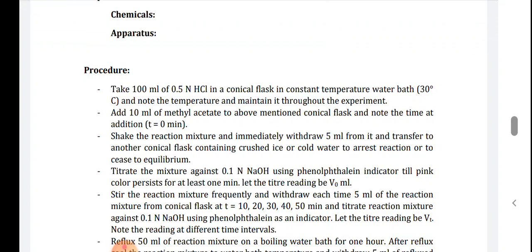Shake the reaction mixture and immediately withdraw 5 ml and transfer it to another conical flask containing crushed ice or cold water to arrest the reaction. Then titrate this mixture against 0.1 normal sodium hydroxide using phenolphthalein indicator until pink color persists for at least one minute. Let this titration reading be V₀ ml.